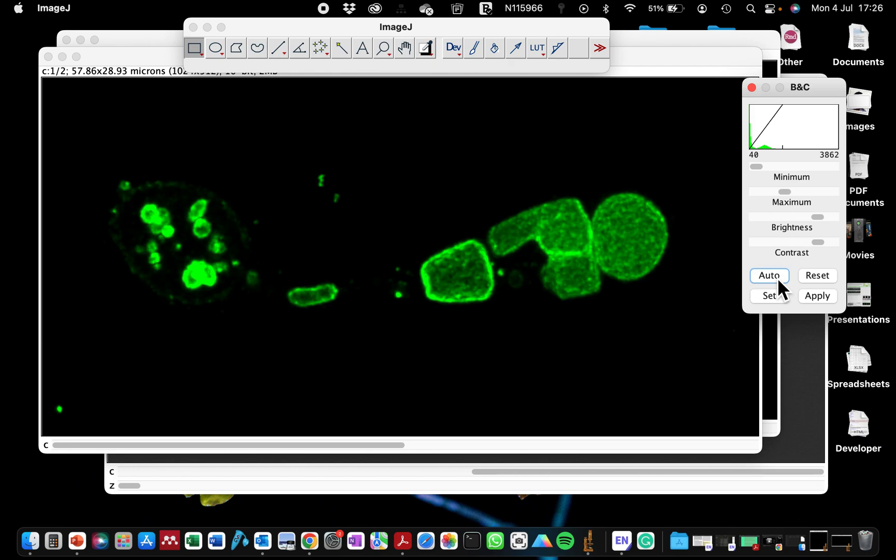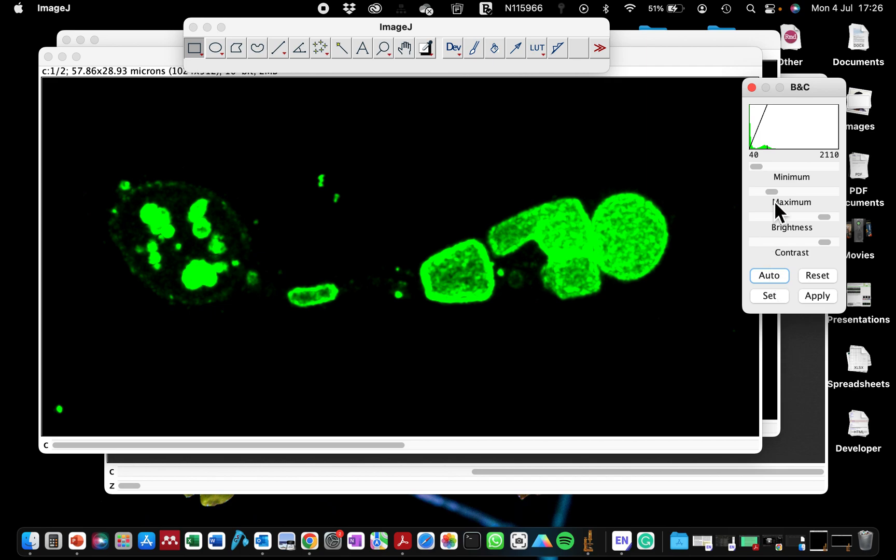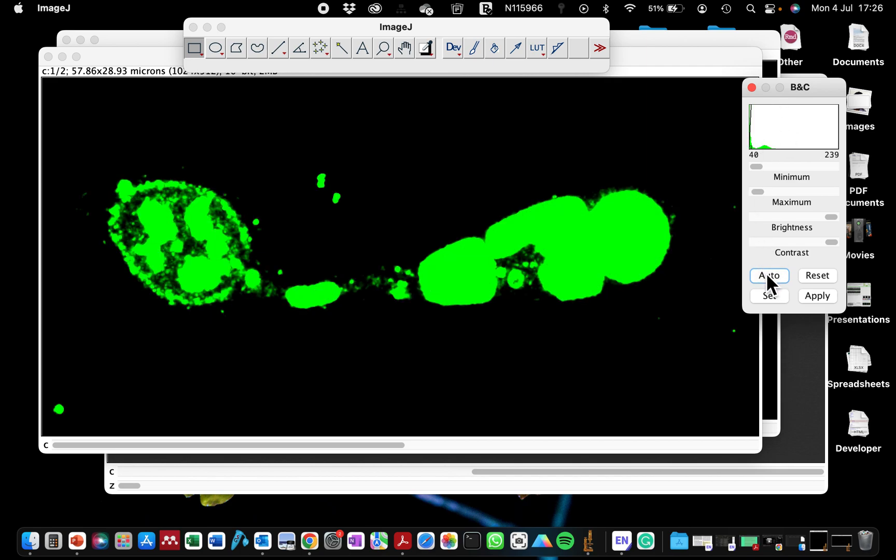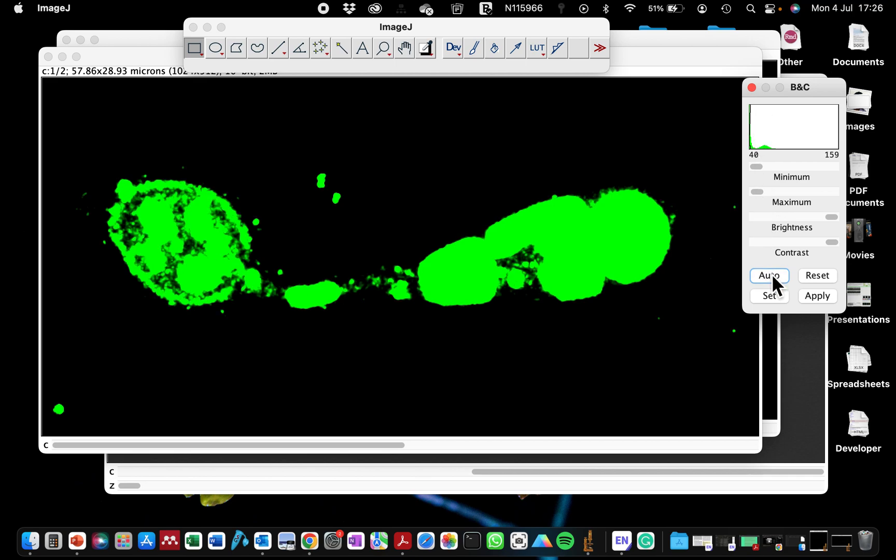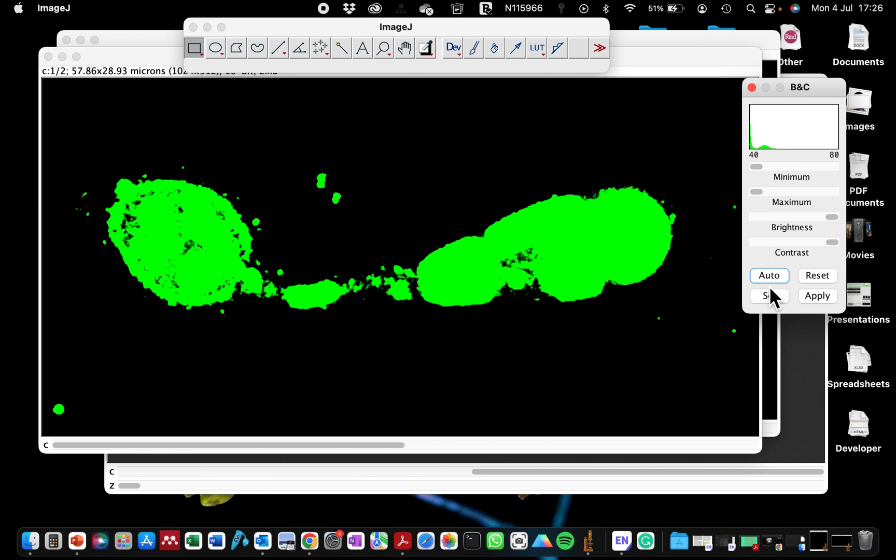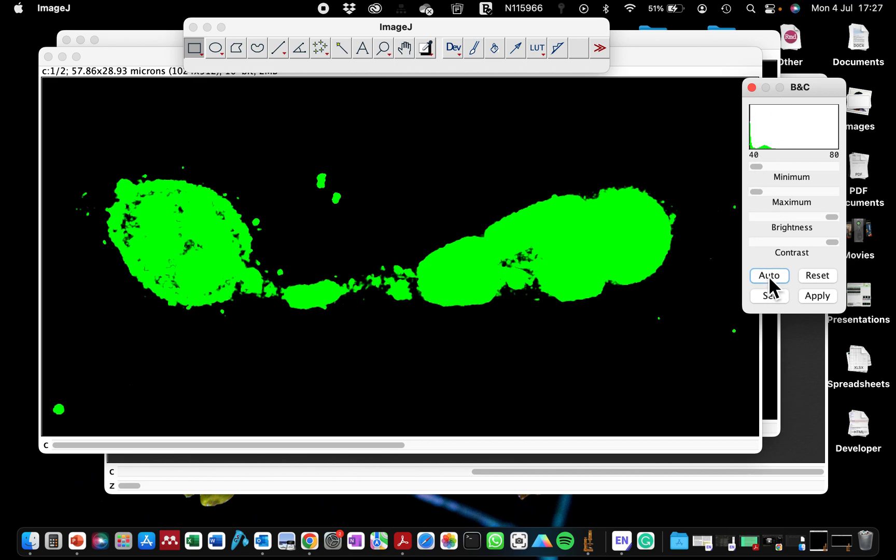You can see that brightens it up and it brightens it up a lot. If you can, you can click on this as many times as possible. You will observe that this bar here keeps raising as you click on the auto. And once it gets to the maximum limits, it will reset back to the original function.